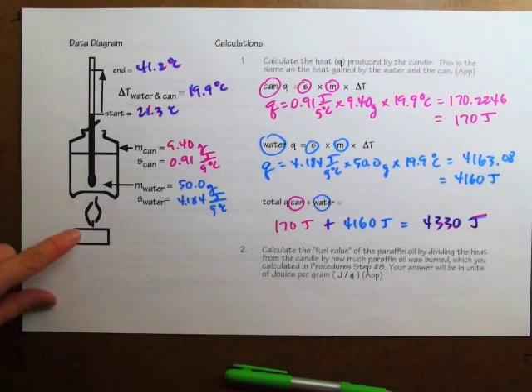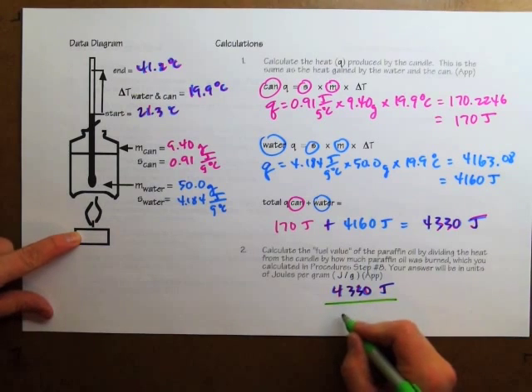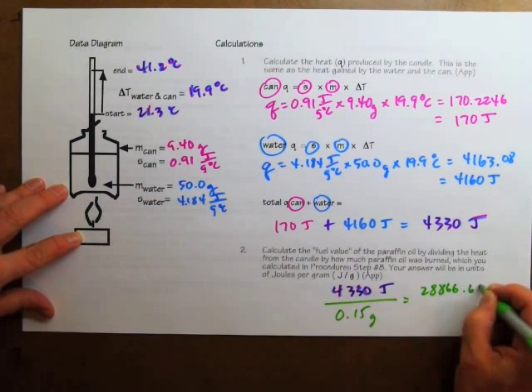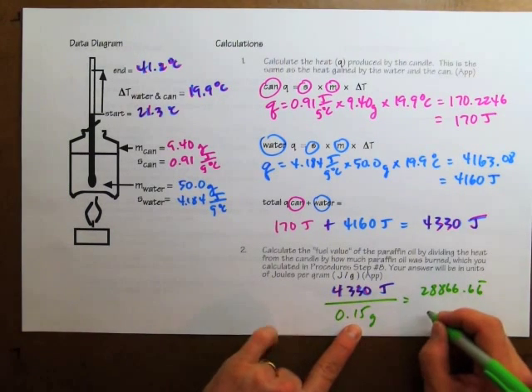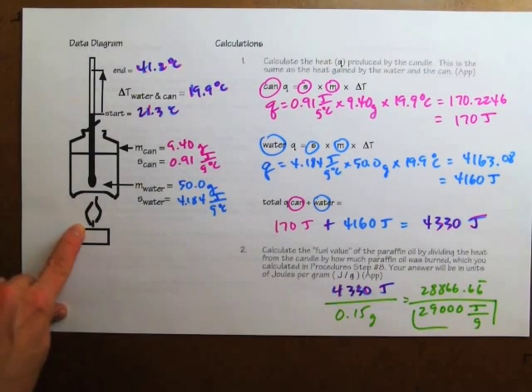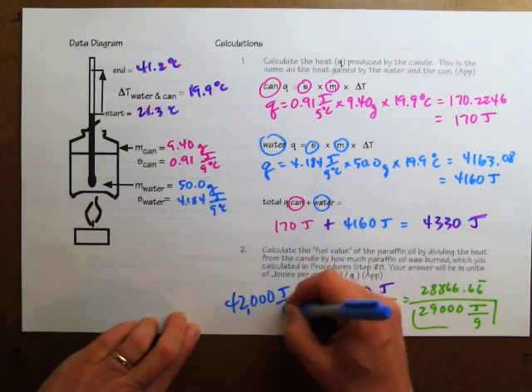That heat came from the candle that was burned. To find how much heat came from each gram of candle, I take the heat total, 4330 joules, and divide by how much candle burned, 0.15 grams. The calculator says 28866.66 repeating, which rounds to two significant figures: 29,000 joules for each gram of candle that burned. However, the expected value is much higher — the known energy in each gram of candle paraffin is supposed to be 42,000 joules per gram.